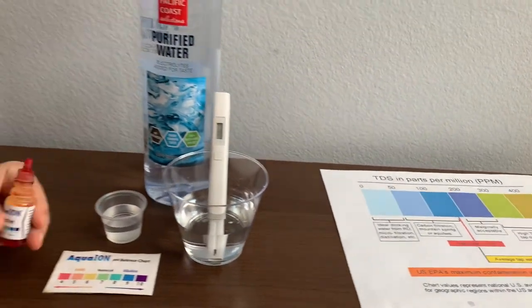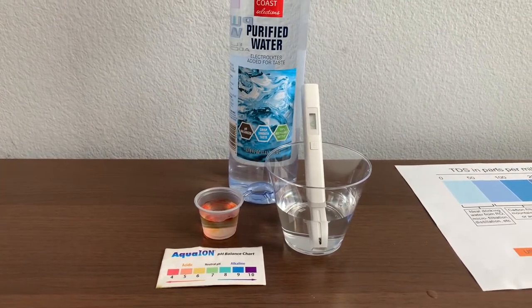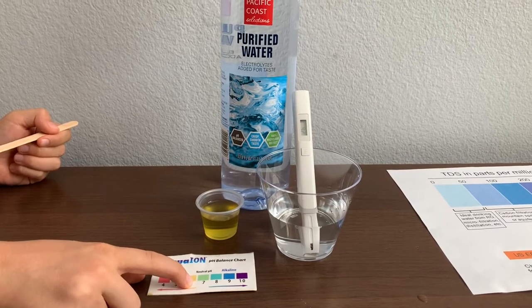Now, let's test the pH level. Only do two drops. Let's stir it for a better result. I give this a 6.5. This is acidic.